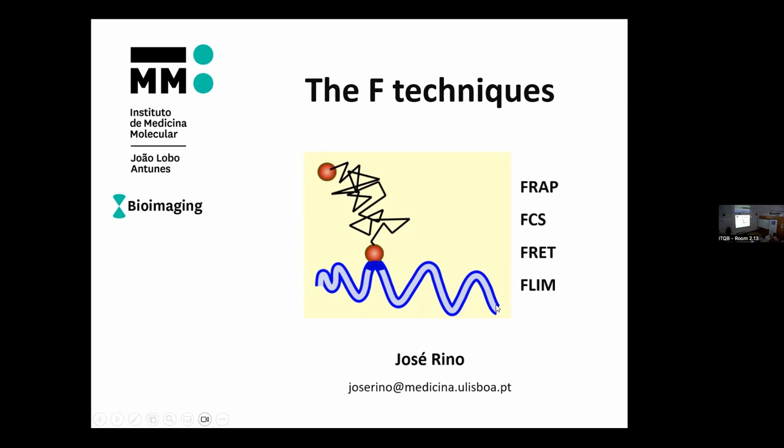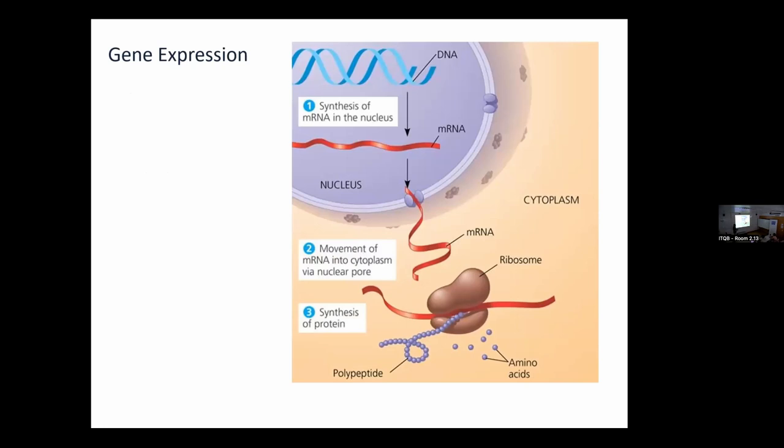So I'm going to show you some results from my own PhD work in the Carmo-Fonseca lab at the IMM, where we were studying mRNA biogenesis, looking at how mRNA is transcribed from the DNA and processed in the nucleus before being exported and translated to proteins in the cytoplasm.